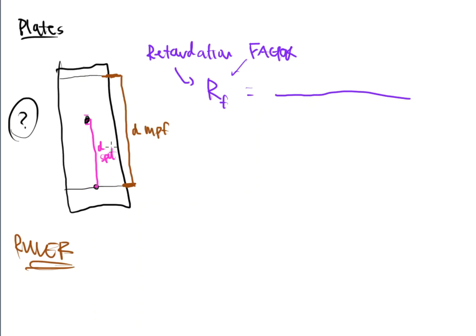The issue here, though, is what if we don't end up with a spot? What if we end up with a smear?